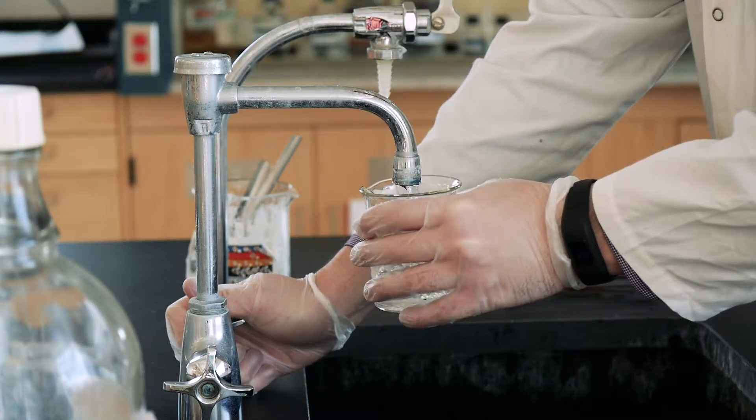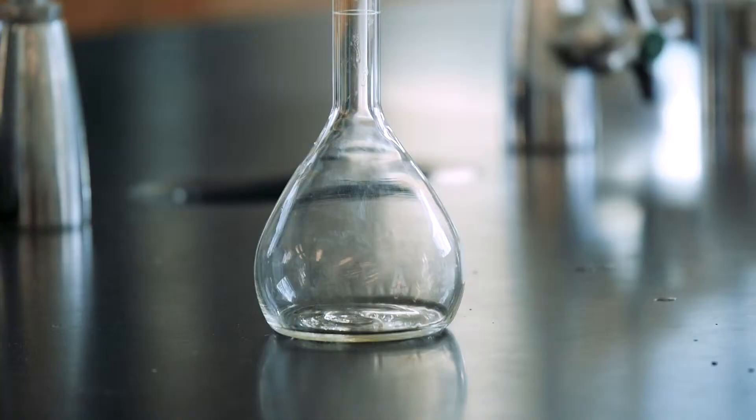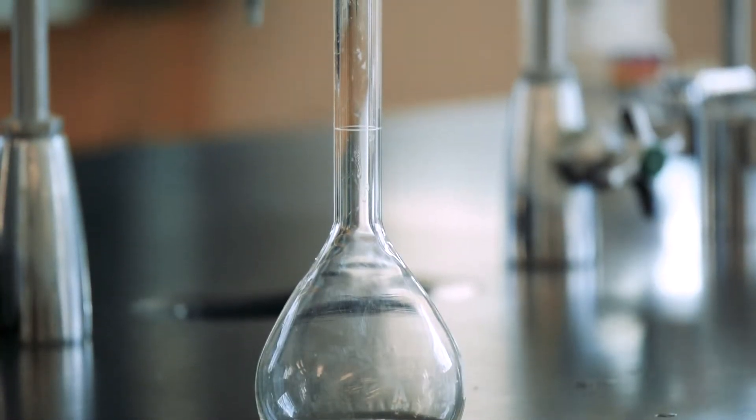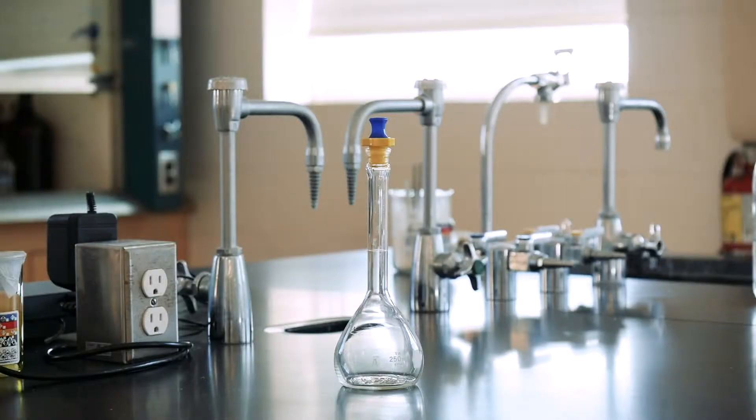Next, fill the flask half full with tap water to rinse. Drain and repeat five times or more until you don't see any more bubbles. Repeat the rinse two more times, but with deionized water, and your flask should be all clean.